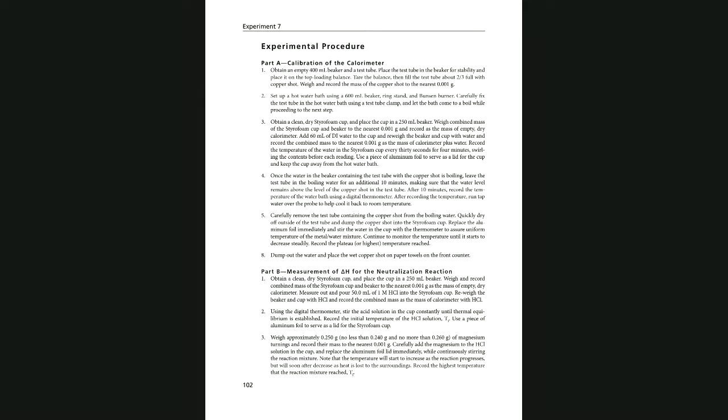Then we are going to do the measurement for magnesium reacting with HCl, and magnesium oxide reacting with HCl, and then you can do the calculation. I will provide enough data for you to be able to do the calculation to find the enthalpy of reaction for combustion of magnesium. So I am going to use my lab manual for the procedure.